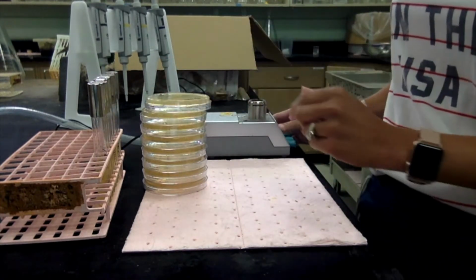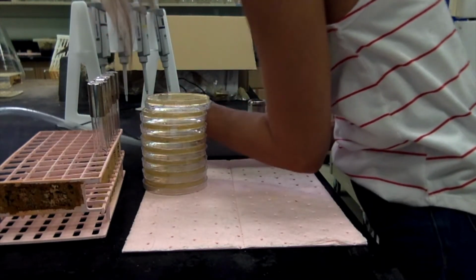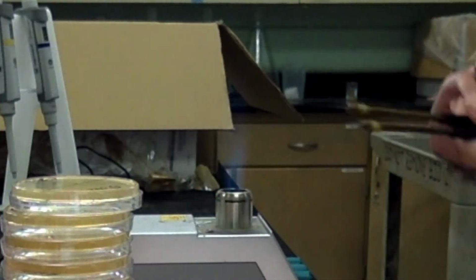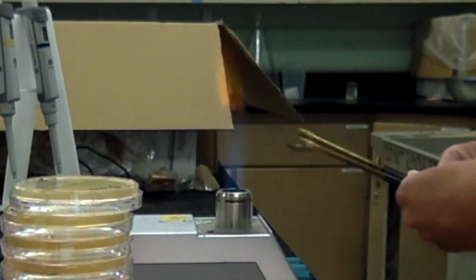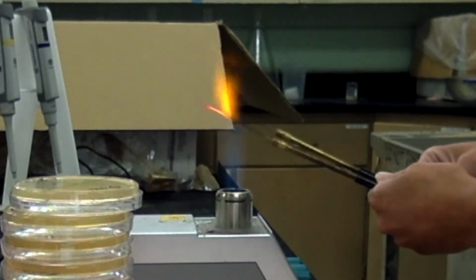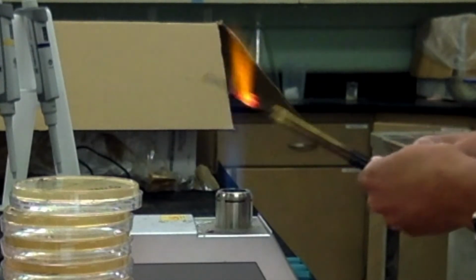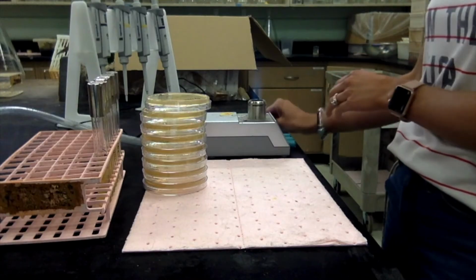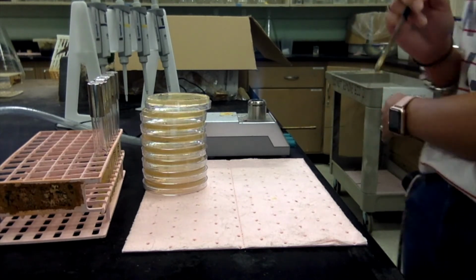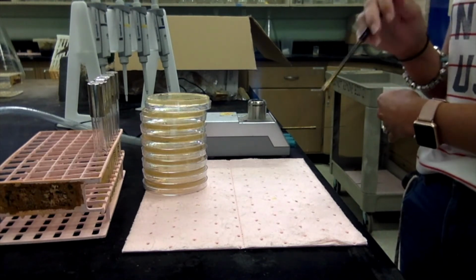Of course, we're going to want to use our Bunsen burner whenever we're doing this, because we want to use aseptic technique. I actually have 2 loops that I'm going to use. This just makes the process quicker because you don't have to wait for them to cool. So I'm going to flame my loops, and I'm going to put them down to the side and let them cool. Remember, we're practicing aseptic technique, so you don't want to touch the loop to anything. That's why I have it on the edge of the table. You don't want to touch anything while it's cooling, okay?